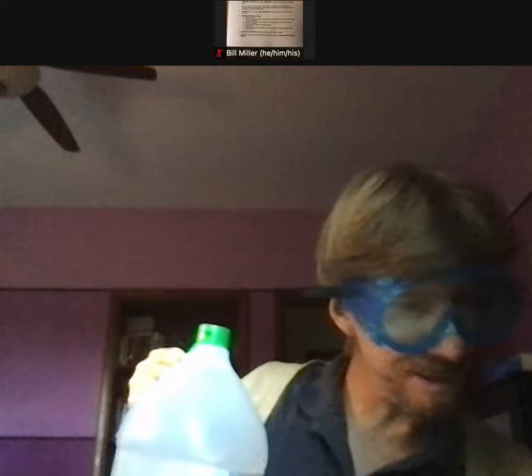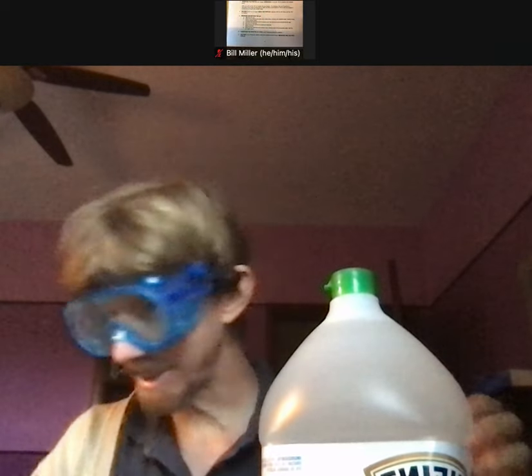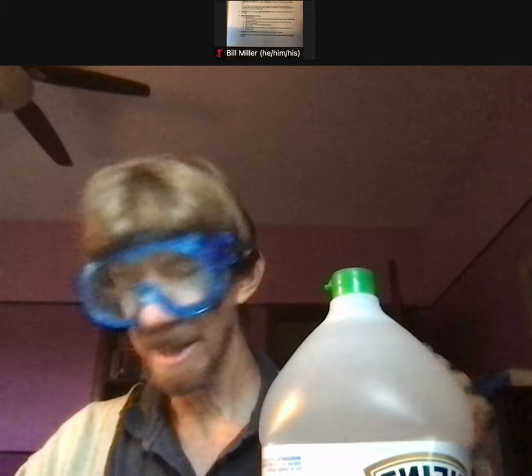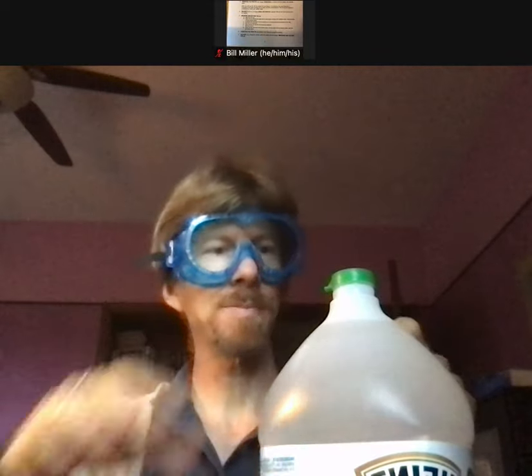Nitration procedure. The first step is to pour 150 milliliters of distilled white vinegar — did I say dissolved? Distilled white vinegar, that makes more sense. I've got my distilled white vinegar right here. We just happen to be out of it because we go through a fair amount of vinegar in our house. I'm going to pour 150 milliliters into a dry 250 milliliter beaker.